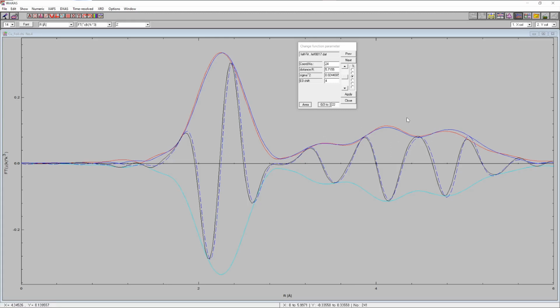We could just set them free and vary them independently in the refinement, and this is of course the first thing we are going to try. But as we will see, this is not a promising approach, and we will need to look for alternatives.